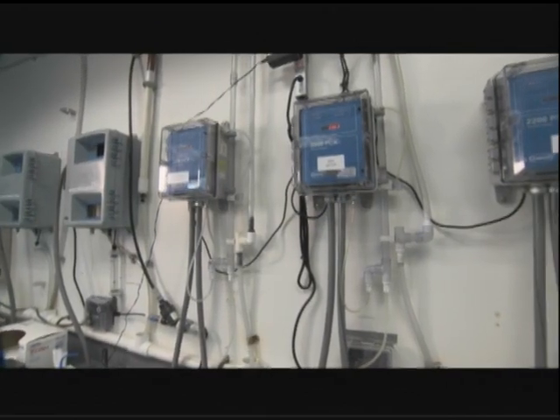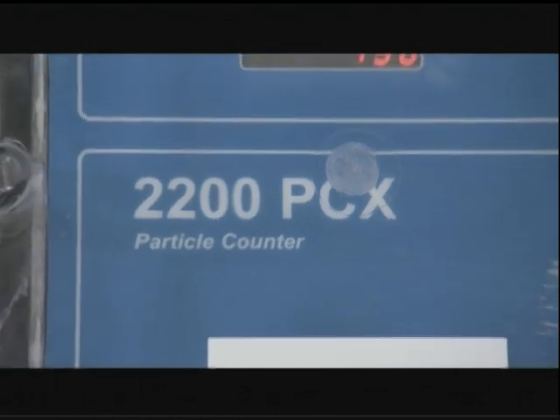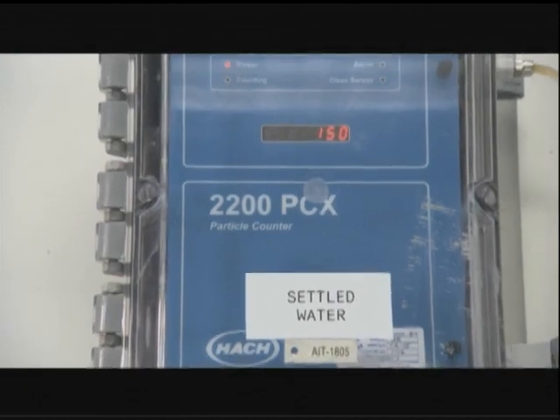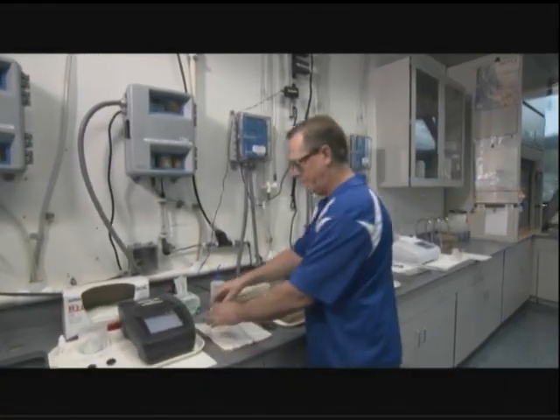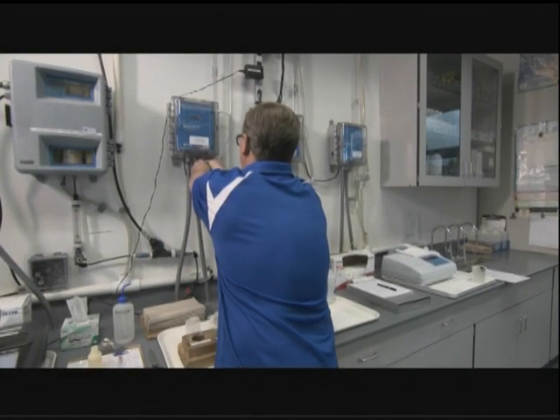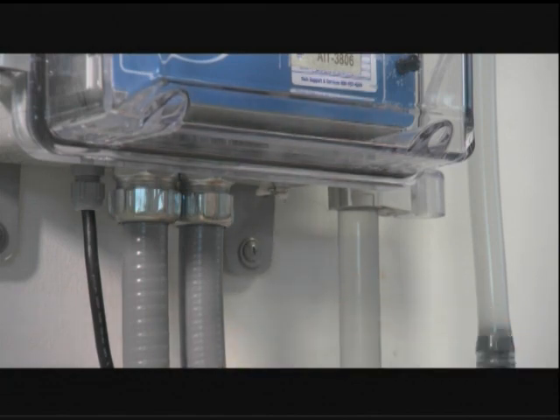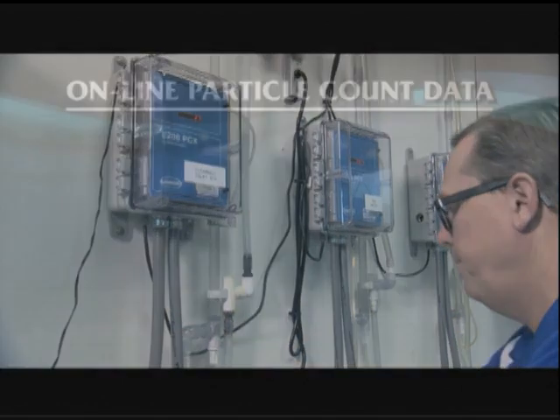The most important requirement for using online particle counters is to maintain a specified flow rate. The flow must be constant and at or near the sensor's calibrated flow rate. Manufacturers offer a wide range of flow rates. Particle counters should be calibrated to match the flow rate of the plant's selected sample point. Particle counters also need to be calibrated so sensors will provide accurate particle size and shape readings. This is done by using calibration spheres of known size and refractive index.